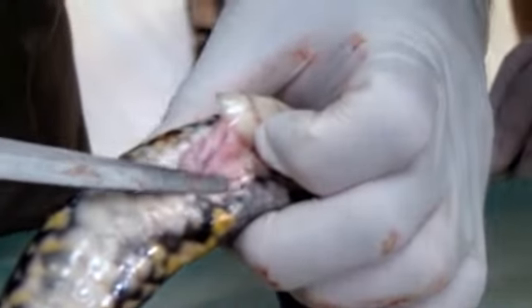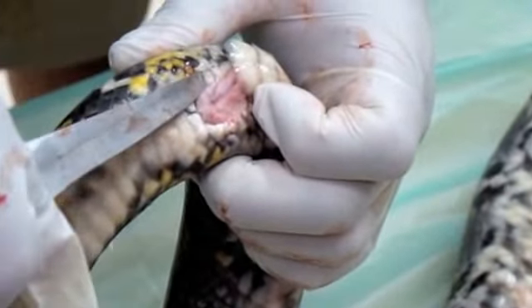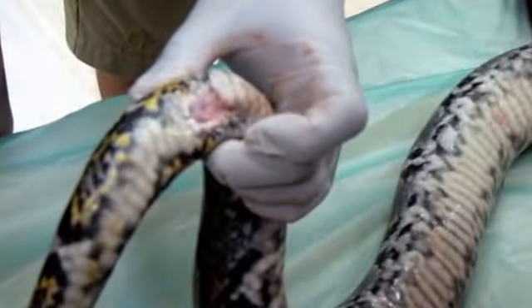Snakes have remnant feet. Two on here and two more further down. I'm not sure where it's at yet, but these are actually lizard-like feet. So they are very closely related to lizards. These guys here, those are feet. Really? Yeah.